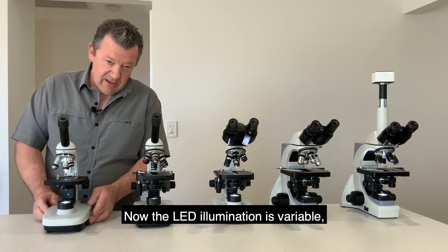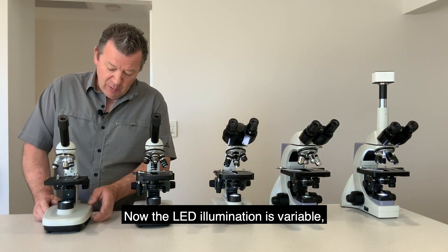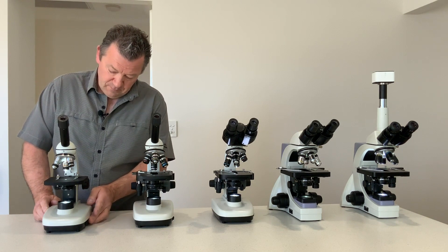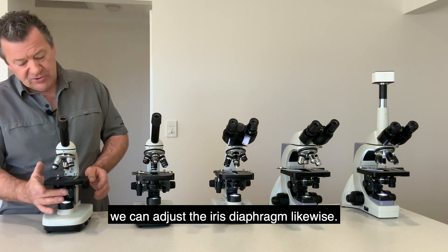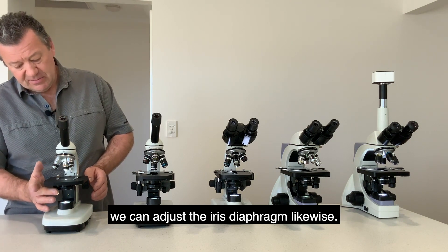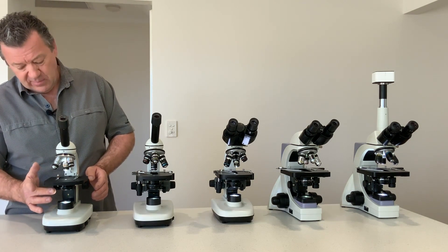The LED illumination is variable, and on the Abbe condenser we can also adjust the iris diaphragm.